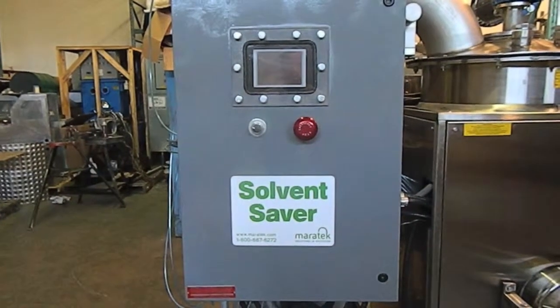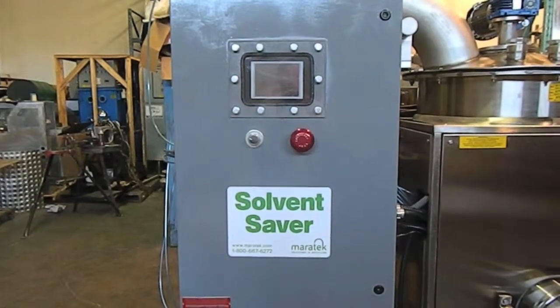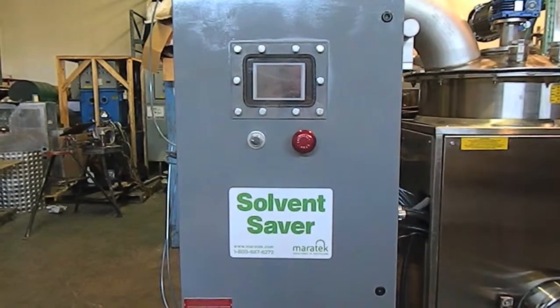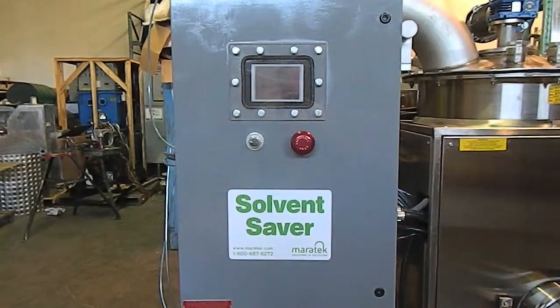It also comes with a fully automatic vacuum system and also auto fill and auto sludge discharge, so it can run continuously and automatically with minimal operator interventions.